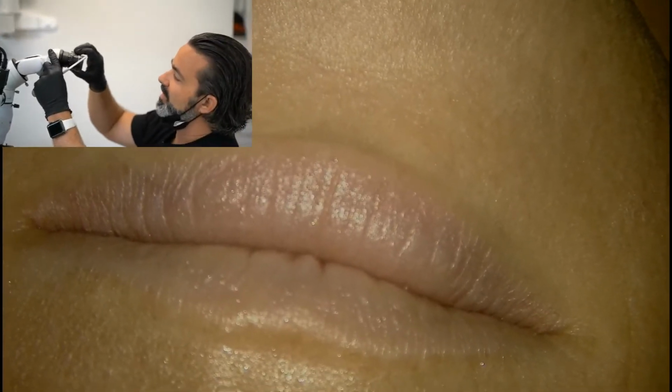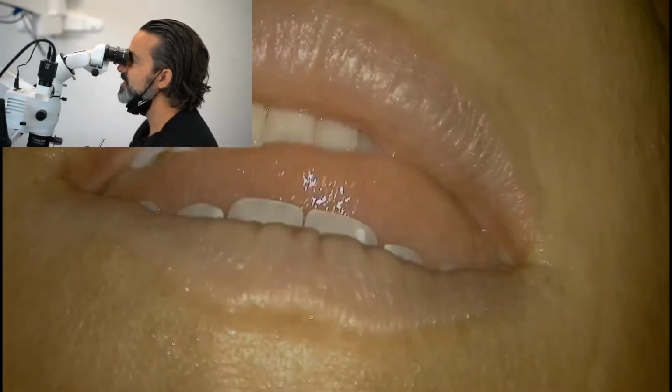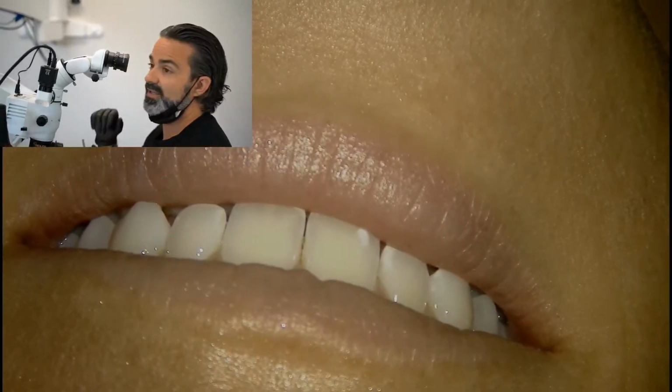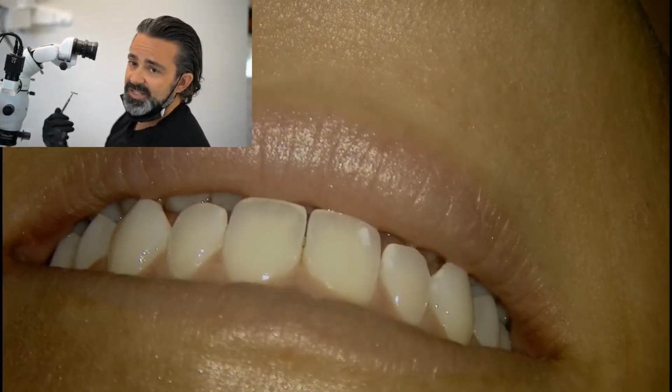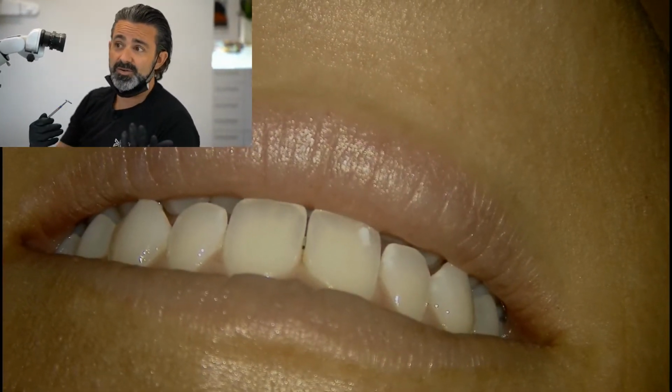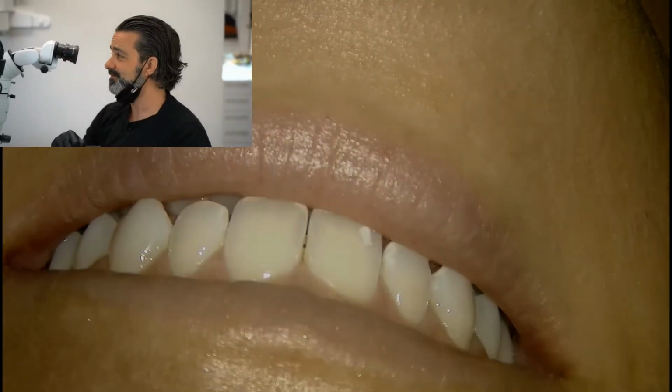That would be a plug for why you would have the caps on, because then at least your eyelashes aren't butterfly kissing the lens, and you keep it clean. But it's just the same if you wear glasses. I don't wear glasses, and if I did, that would drive me nuts. I would just cut those suckers off.